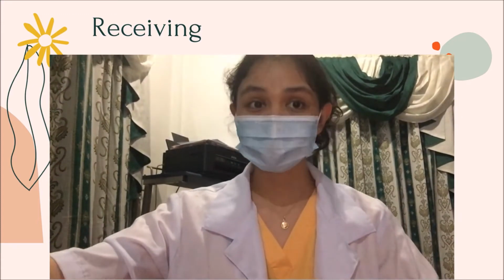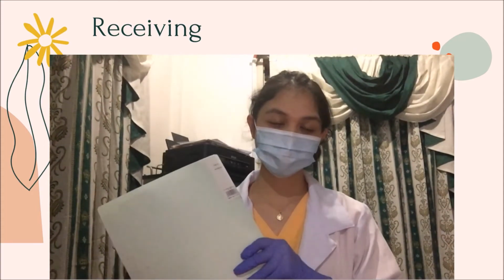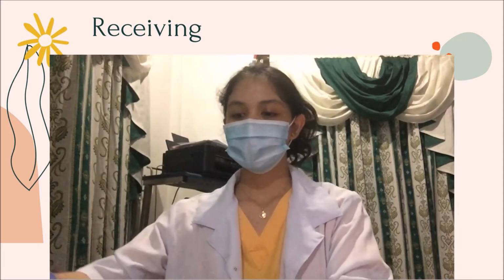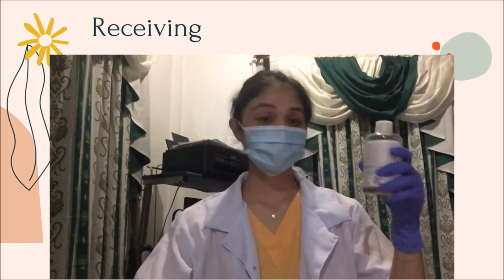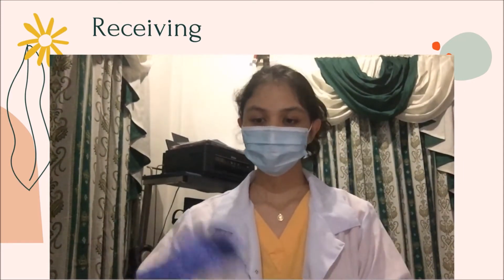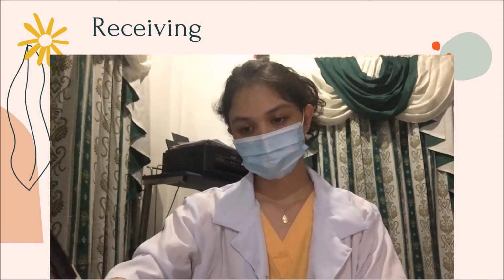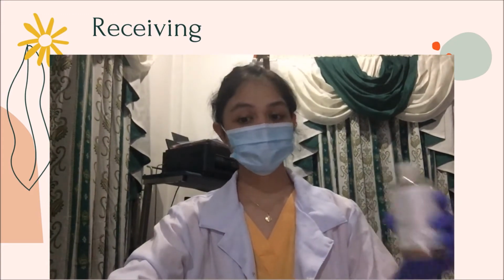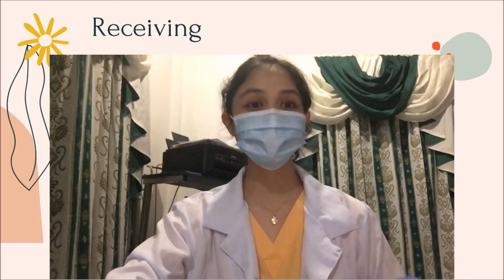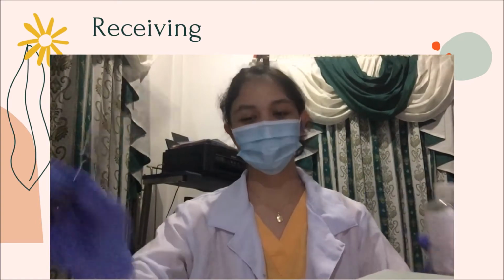So now we're gonna get the logbook here in our department. So this is the logbook for histopathology. And what happens here is that we're just gonna write down all the information that comes with this. Okay, so after writing all the information, we are not yet done because we will be needing also the name and the signature of the person who brought this specimen here in the laboratory.